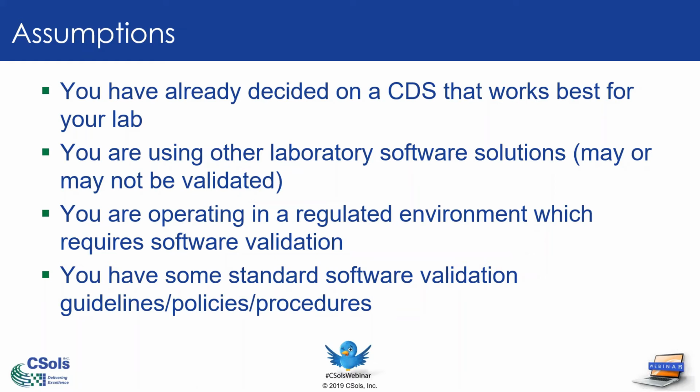What that means is I'm not going to spend time going into the different chromatography systems in their specific functions or functionality. There's OpenLab, Agilent OpenLab CDS, or Chromeleon, or Waters Empower. So whether you've decided on one of the top tier systems or another one, I'm not going to spend too much time going into details on those.